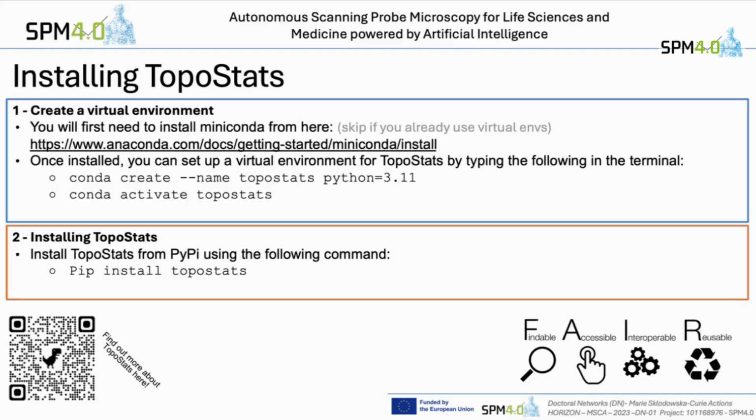Okay, three years back. Just install it. Oh, you got that. Okay. Yes, let's go. So you're installing that. Yeah. GUI.